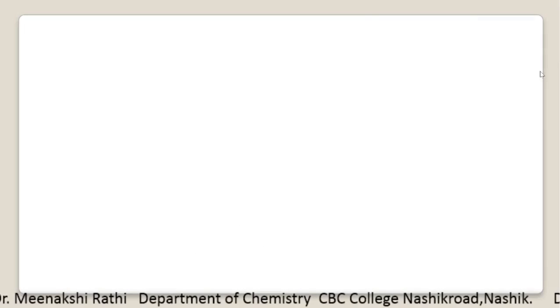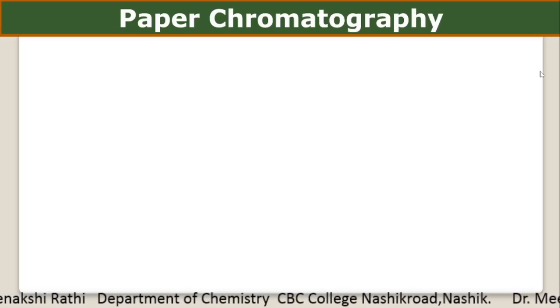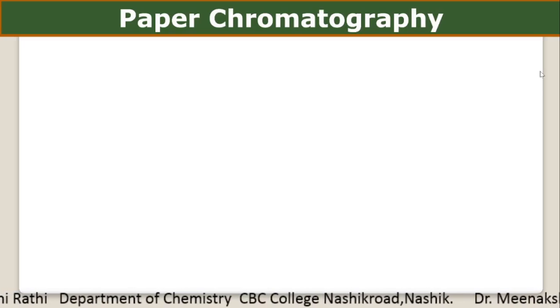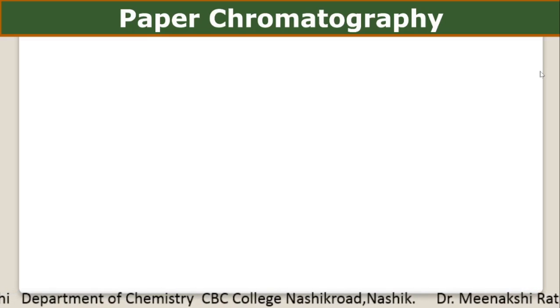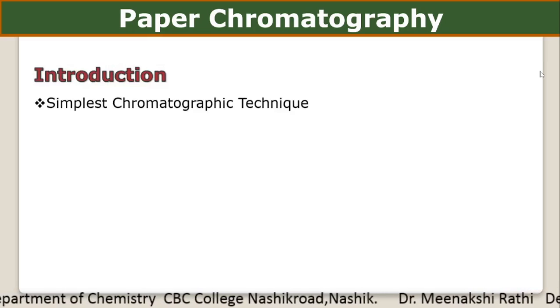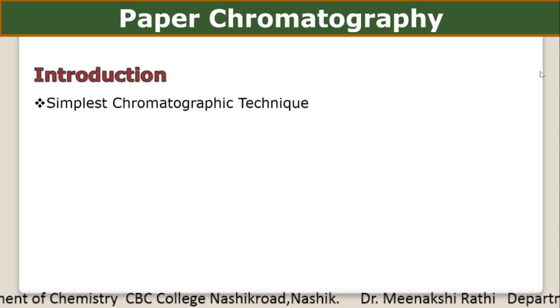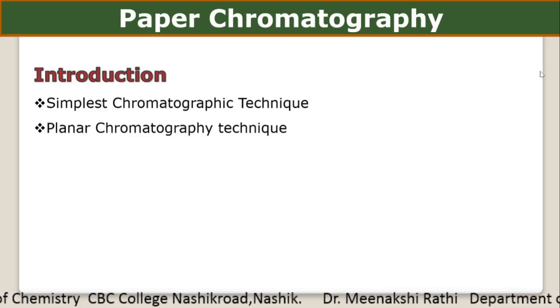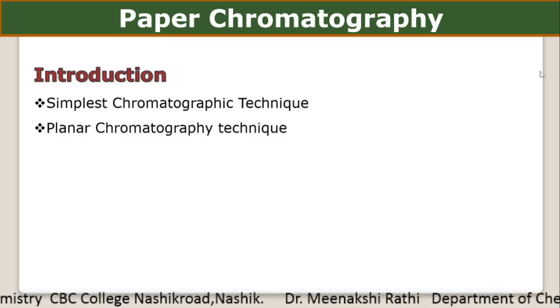Welcome back, dear students. Now let's discuss a new technique, that is paper chromatography. As per the name, specialized paper is used in this technique, and that's why it is called paper chromatography. Paper chromatography is one of the simplest techniques in chemical separation, as it runs on a piece of specialized paper such as cellulose filter paper.